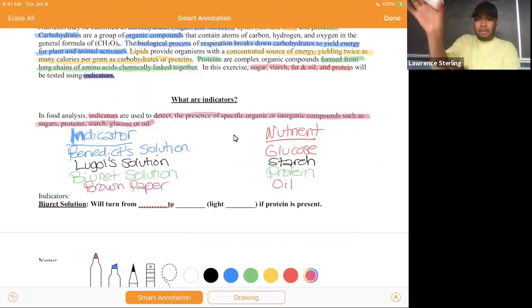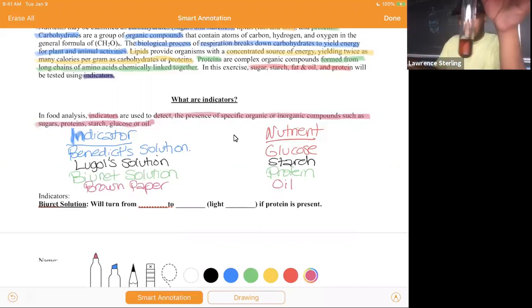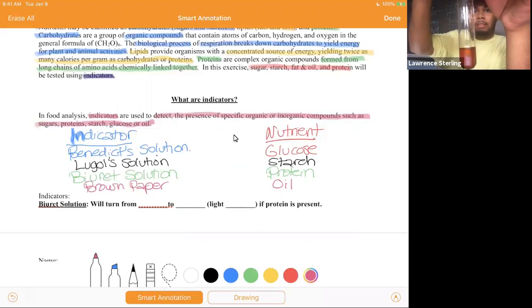It's starting to settle. We're gonna put a few squirts of starch in with the amber colored iodine solution that we just put in here. And we're gonna squirt it in.